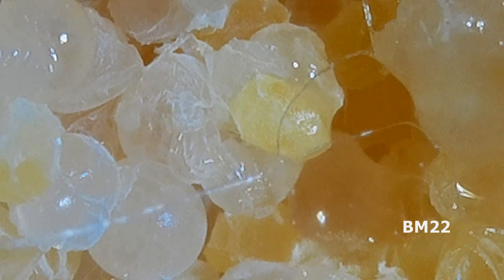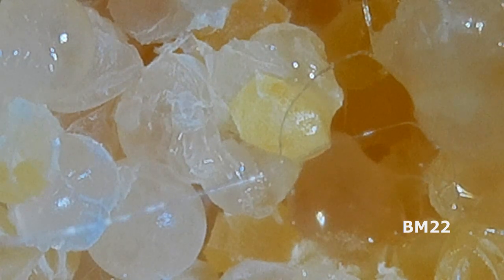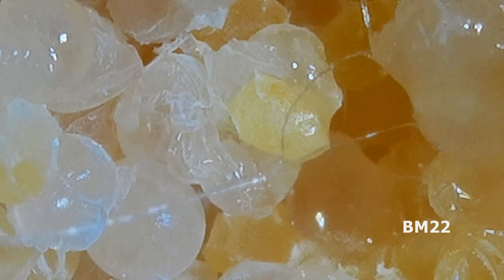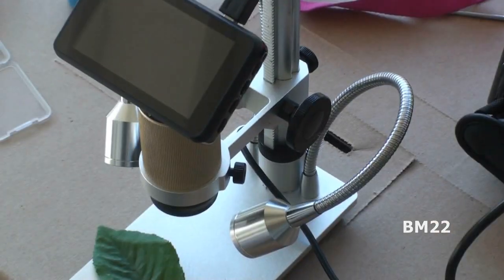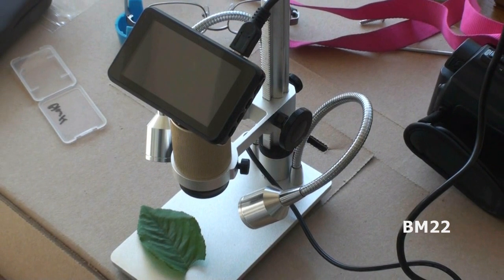All right, so what do you think? This video took me well over a week to make. It didn't take you a week to watch. And I thought it was pretty interesting that we actually had some good magnification of the egg cases, which is something we clearly couldn't get from that first digital video microscope. And really quick, I'll do a full review on both of these microscopes, the really cool KK Moon one and this horrible Coolertron one.